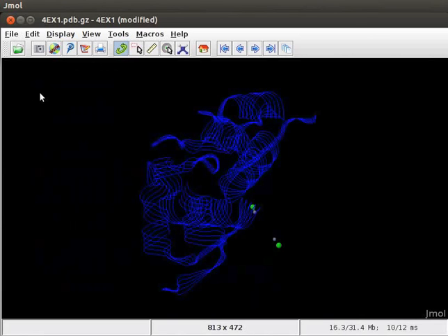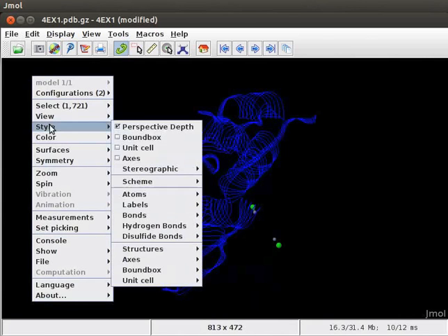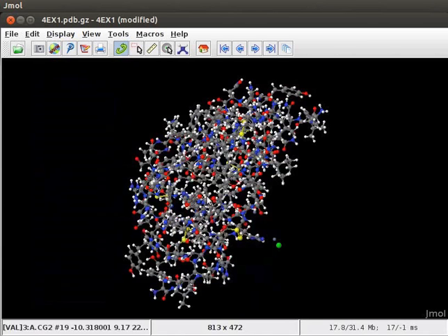To convert the structure back to Ball and Stick display, open the pop-up menu, select Style, then Scheme, and click on Ball and Stick option.